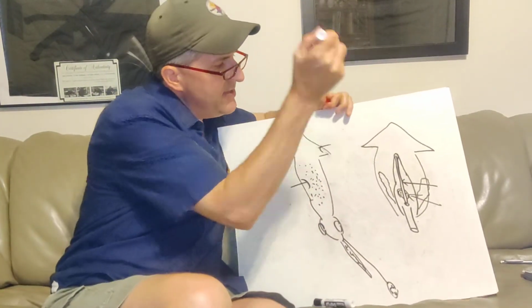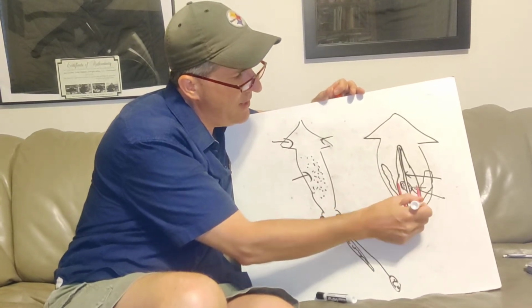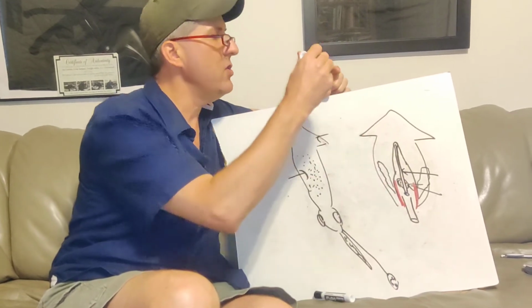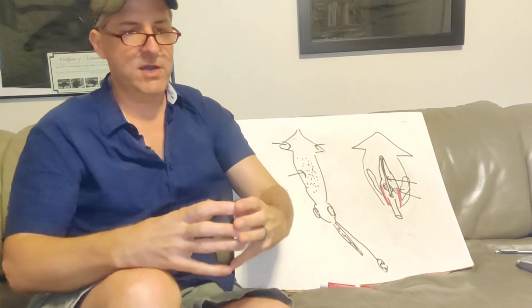On the outside of the stomach, there'll be 2 large muscular tubes. 1 here and 1 here. Well, this one in the middle is the excurrent siphon. These 2 are the incurrent siphons. So what you've got to think of is this bell is like this big empty structure. So when it opens up, it causes a suction and water flows in through the incurrent siphons.